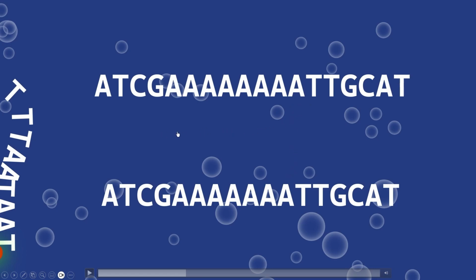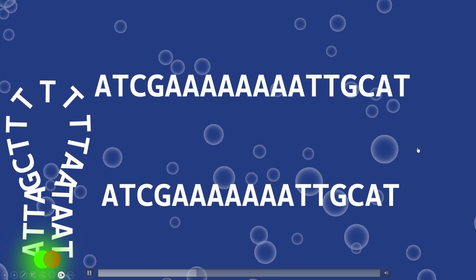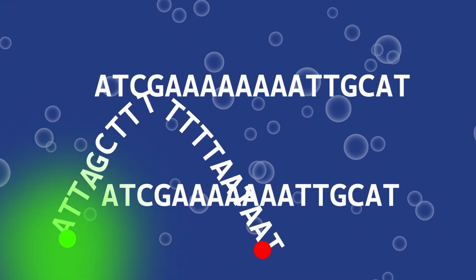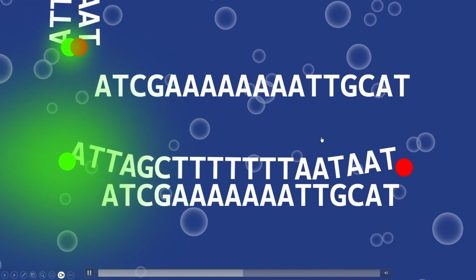So here's where it gets interesting. So we have these different probes here. So it's a melt curve analysis, but we'll get to that later. So they have this kind of hairpin sequence here. So it's self-complementary here, which keeps the reporter and the quencher together. So it's kind of like when we talked about real-time PCR, which is the techniques lecture. As long as the reporter and quencher are nearby, the reporter is not able to fully fluoresce. But the middle sequence in this hairpin loop is going to be complementary to this one base pair deletion specifically. So they're probing for that deletion. And when it binds, it separates the reporter from the quencher, so the reporter fully fluoresces and can be detected.